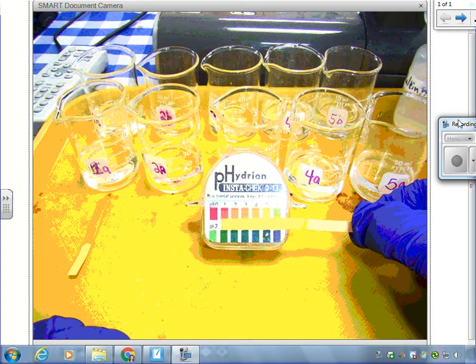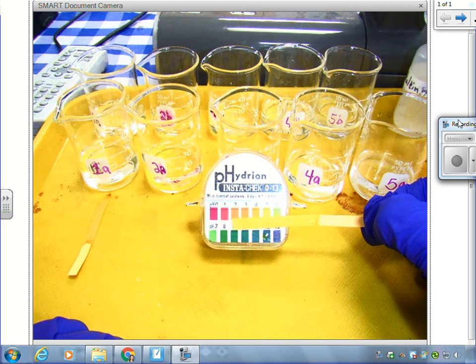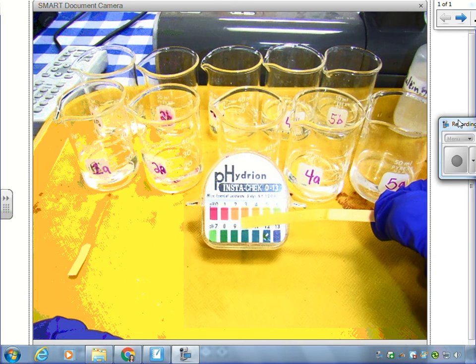And it's okay to estimate or guess here. You do not have to be exact. I know it's a little bit hard to see and you're not expected to be exact. Just take your best guess.